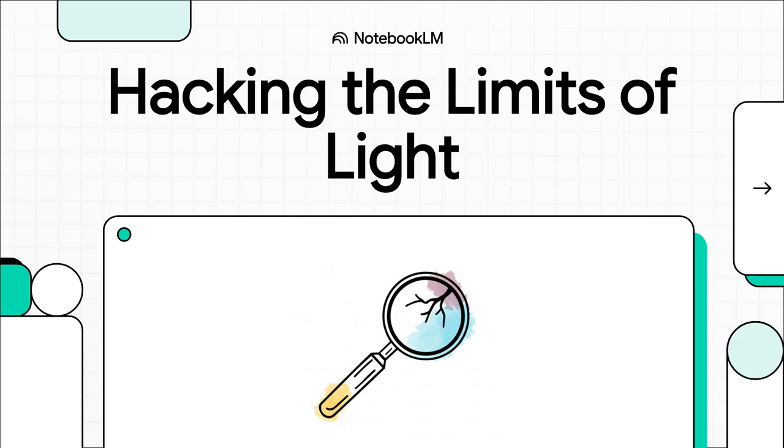Have you ever really thought about the absolute limits of what we can see? I'm not just talking with our eyes, but with our most powerful microscopes. What if I told you there's a hard wall, a physical barrier, that for over a century we believed was just unbreakable? And then what if I told you that scientists have figured out a way to smash right through it, not with a better lens, but with a ridiculously clever piece of software?